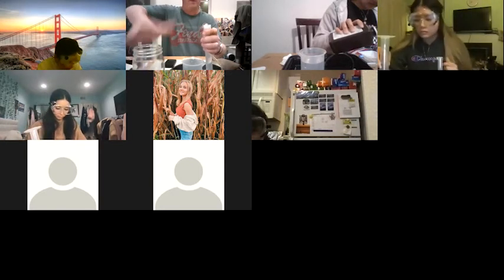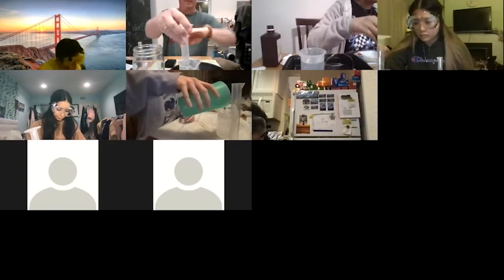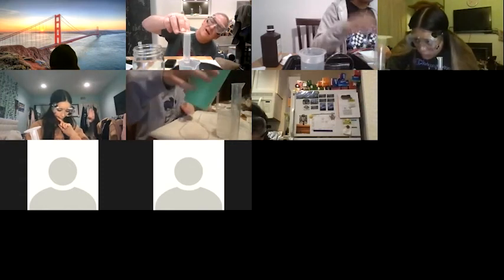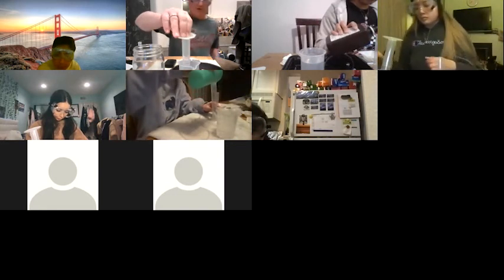There we go. Oh, I got an air bubble this time. All right, I'll have to subtract 2.